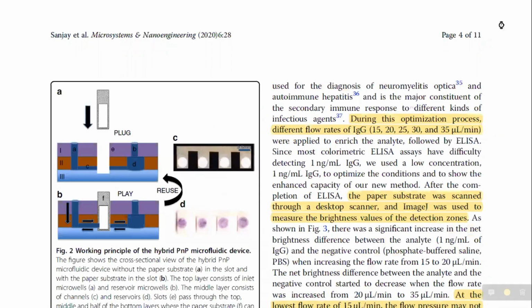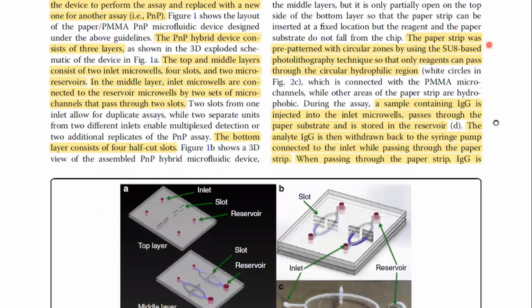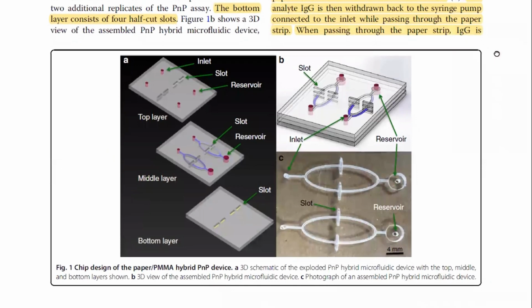Here we can see the chip design. This specific part of the chip is made purely of PMMA, that is polymethyl methacrylate.